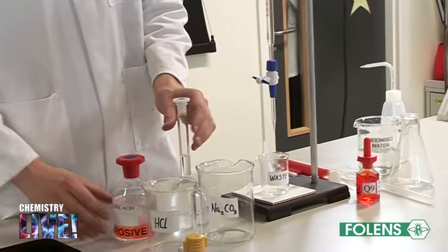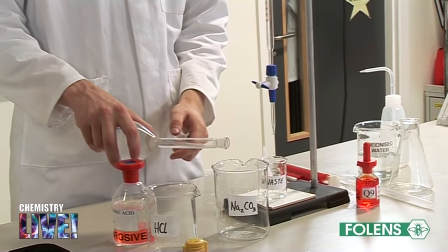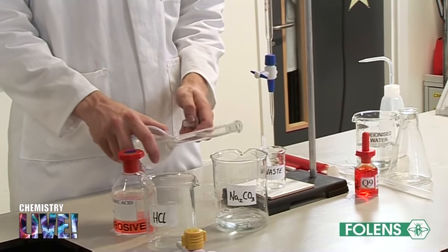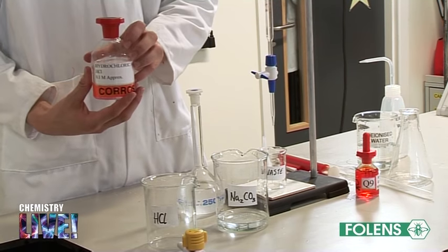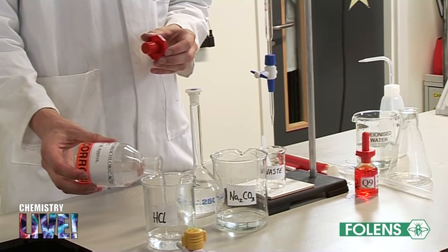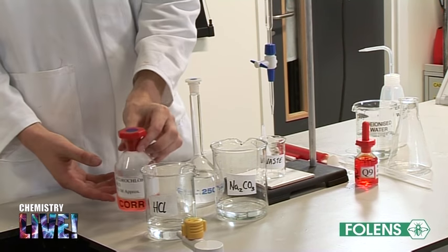Pour about 100 centimeters cubed of the sodium carbonate solution from the volumetric flask into a clean, dry beaker. Also, pour about 100 centimeters cubed of the hydrochloric acid solution into another beaker. Label both beakers. We have now finished the first part of the procedure. The pipette, burette, and conical flask have been rinsed out with deionized water.